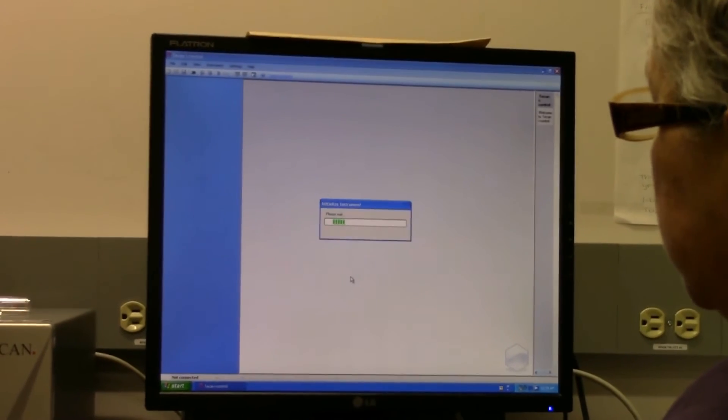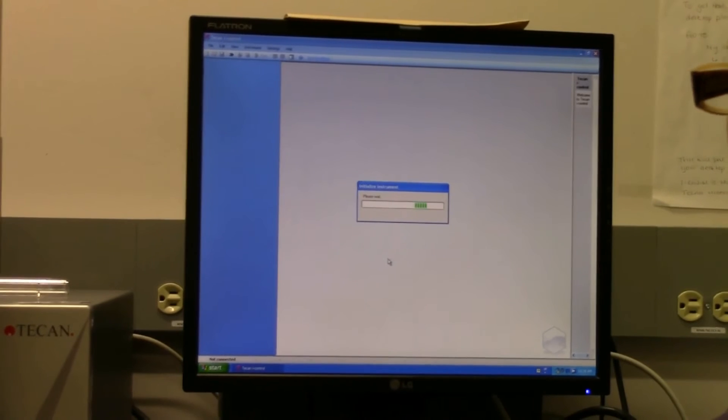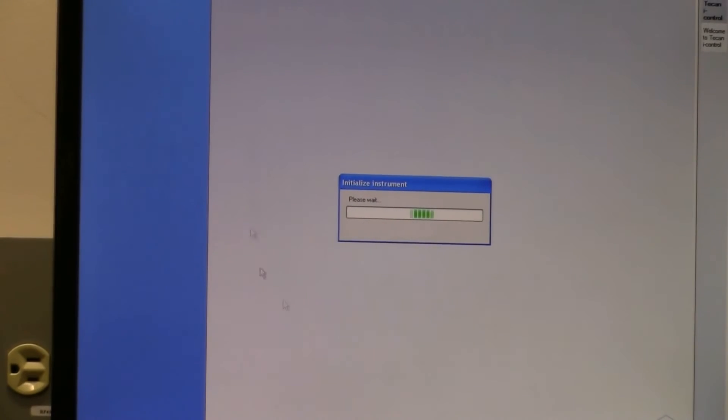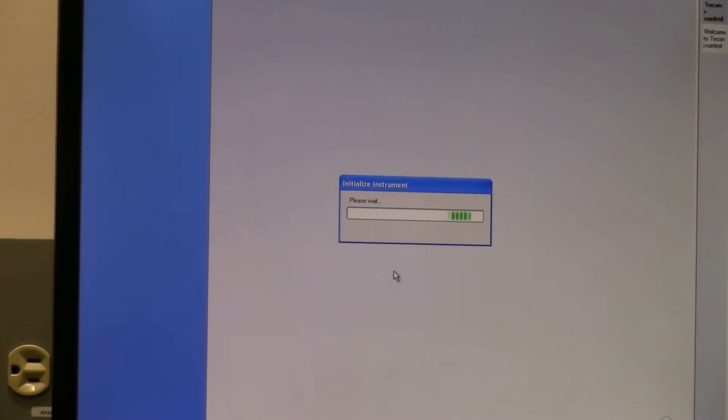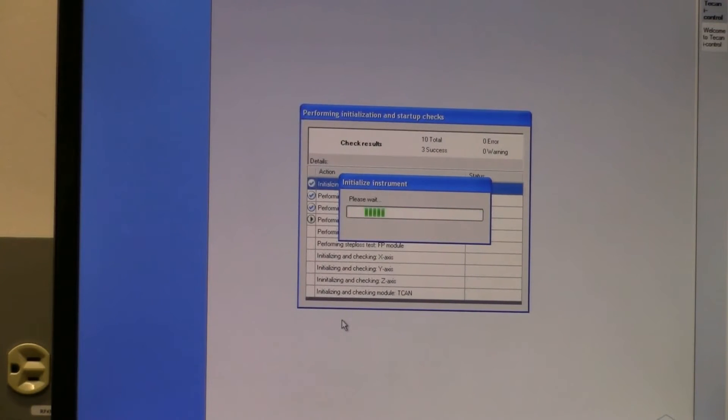If you don't need the stacker, then you can leave that box unchecked. Then it will go through this initialization protocol where it does a bunch of checks to make sure that everything is working properly.